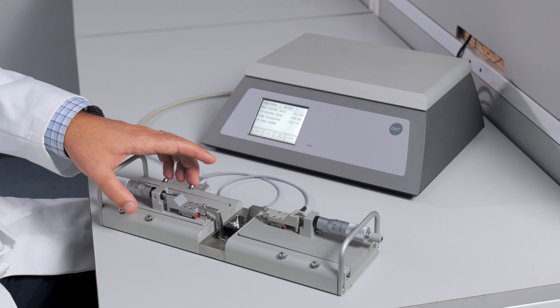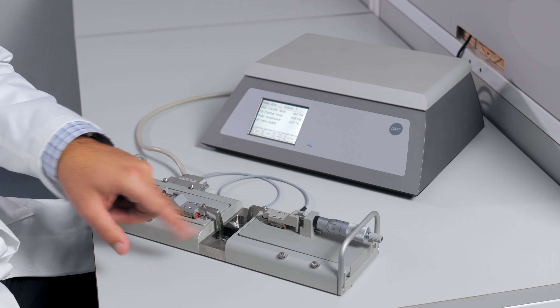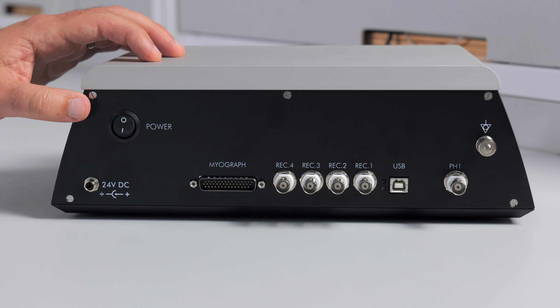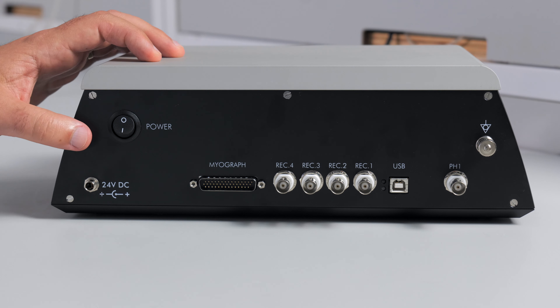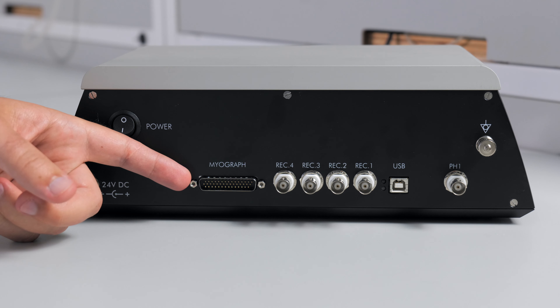Each side also has four positioning screws that allows you to accurately align the two jaw mounts. The back of the interface has all the connections to fully utilize the system. You have a power supply and a power switch, and a connection for the myograph cable.